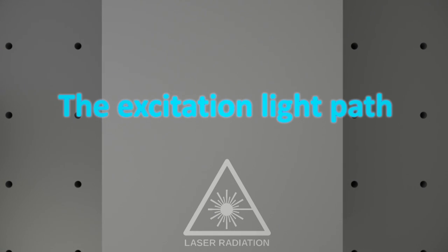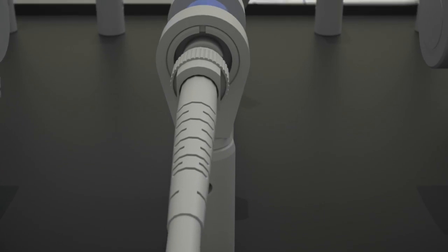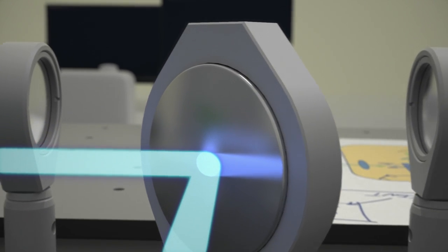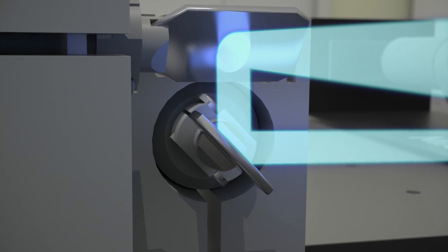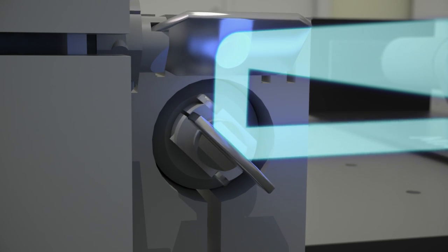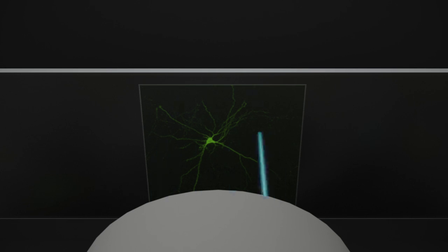The excitation light path. The excitation light from the laser is guided by the fiber into the RCM unit. From the tip of the fiber, the light is collimated by a lens and hits the first mirror. The collimated beam is reflected by the dichroic mirror. The mirrors of the scanner direct the beam to the scan lens. Because each mirror rotates on an independent axis, the laser light scans the surface of the sample. The light propagates through the microscope and excites the sample in a small spot. Because of the scanning motion of the light, the scanner reads the object.